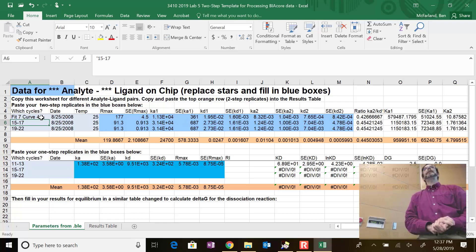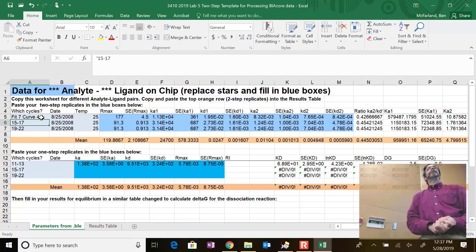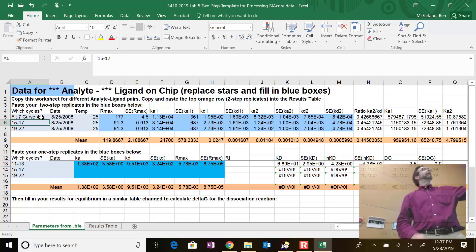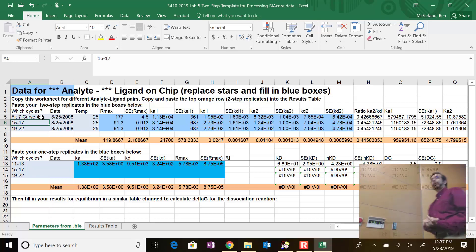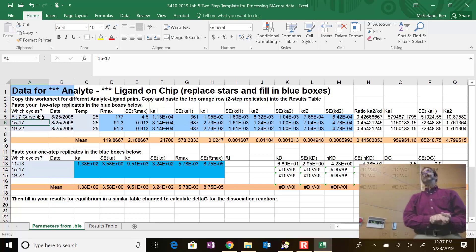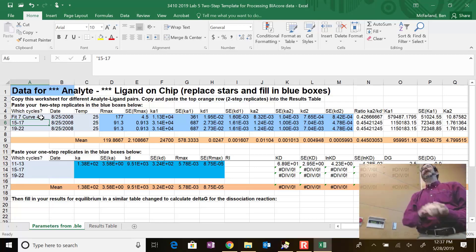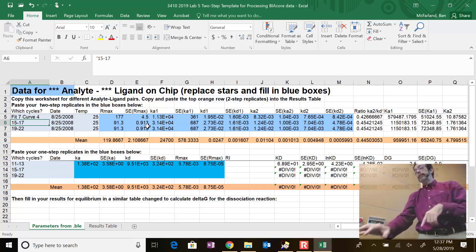By the way, 10^-5 is flat, and 10^-4 is close to flat. When you see 10^-5, start asking whether you're really seeing anything - that may just invalidate your two-step fit. If your curve is too flat, shrink the end of the dissociation window to include less of that later phase.